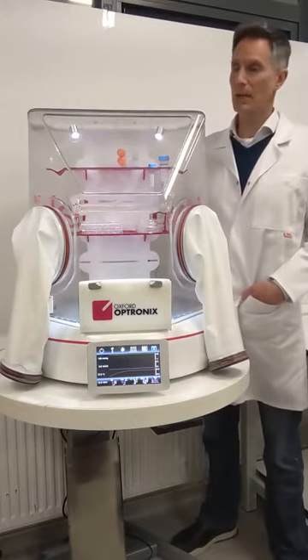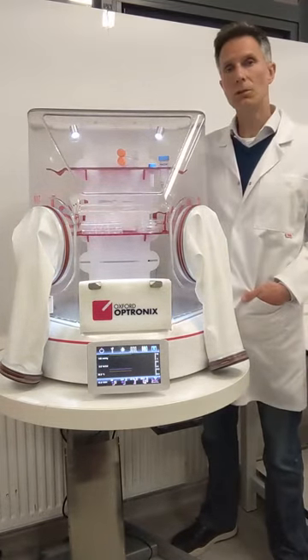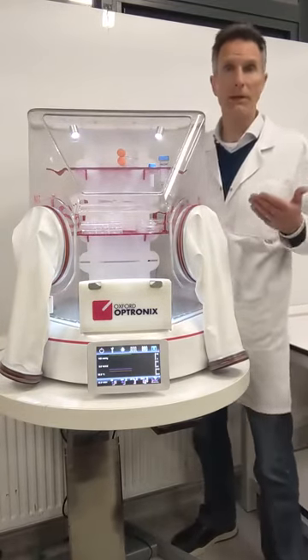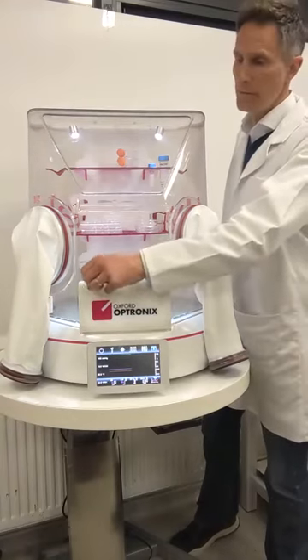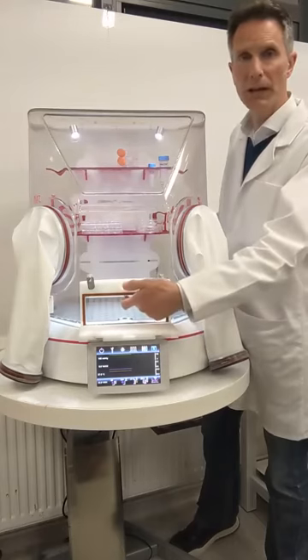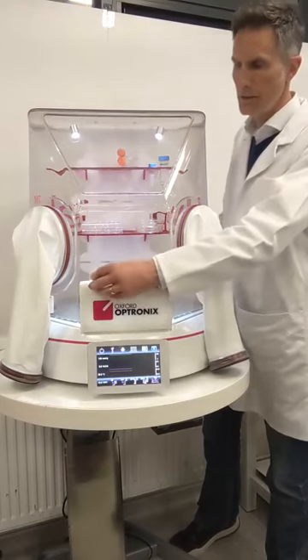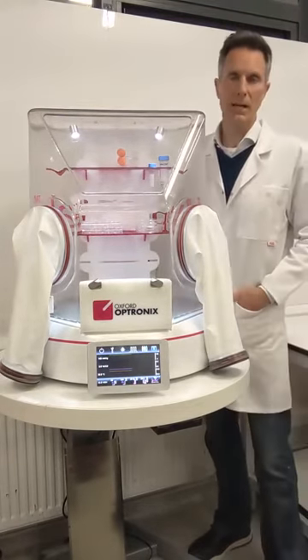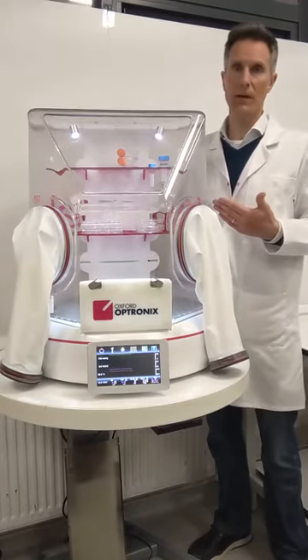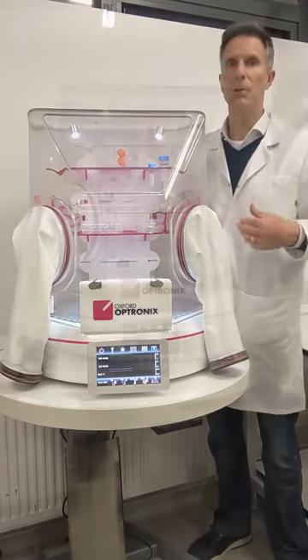And fundamentally, it is just a very simple system to use, and that is partly because we don't use a transfer hatch to be able to pass samples in and out of the system. That is done very simply via a letterbox system that allows samples to be passed in and out of the system very simply through a flap in the front. The system recognizes such activity and compensates immediately to ensure that the internal oxygen environment is not affected, or only very minimally affected, when the flap is opened.